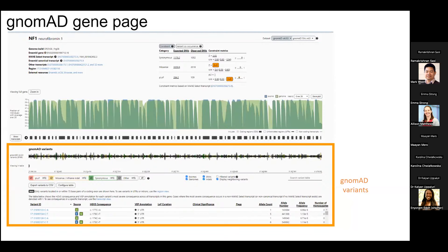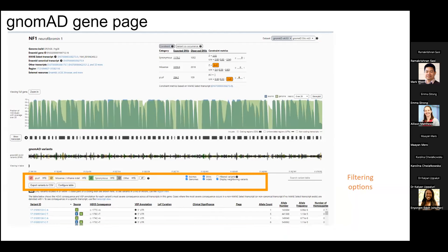Below the ClinVar section, there's a section describing all GnomAD variants reported in the gene with a corresponding table. You can filter to look at just loss-of-function variants, filter by exome or genome dataset, SNVs versus indels, and you can choose to show variants that were filtered out following QC. One underutilized feature is the ability to configure the variant table to add columns — for example, HGVS cDNA nomenclature isn't part of the default options but can be added. Any filter you apply can then be exported.